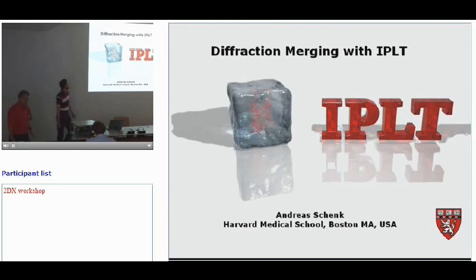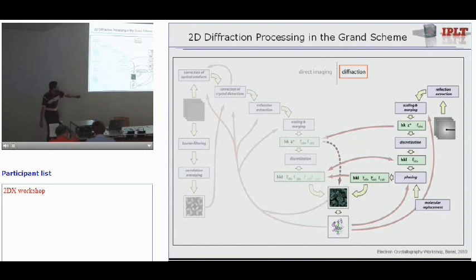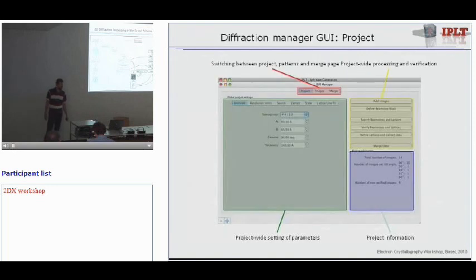Okay, so I'm now going to talk about the diffraction merging in IPLT. This is the second part of the processing from what we had before. So this diagram you already know. This morning we were here, up this one arrow, and now I'm basically trying to cover all the rest. Not the phasing. This will be afterwards another talk by Rich. So just scaling, merging, discretization of the diffraction data.